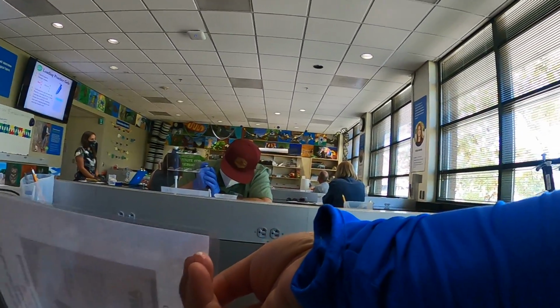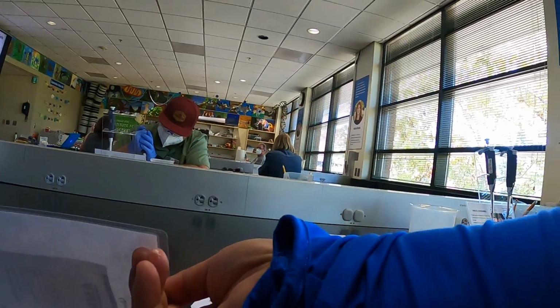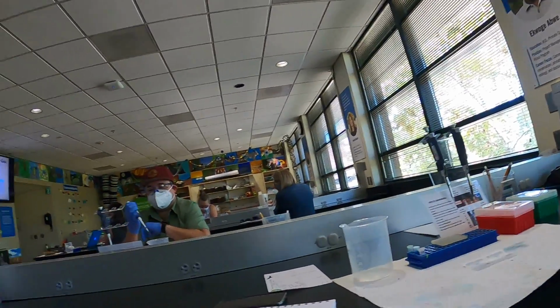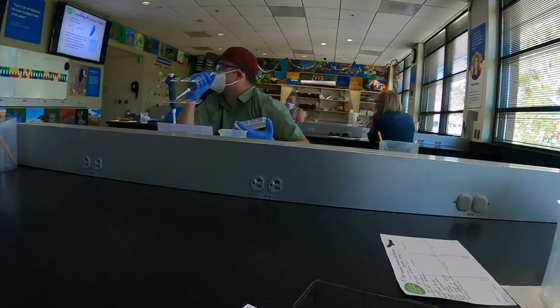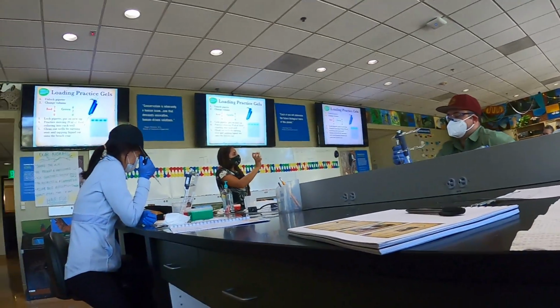The gel has a little pocket? It does, yeah, and I can show you all what it looks like, because I'll be loading in just a second. So, like I mentioned, these are made of agarose. This is 2% agarose gel that we use. So you can kind of see it like this, and if you smell it, it actually kind of smells like seaweed a little bit. So these are pre-made gels that we use.